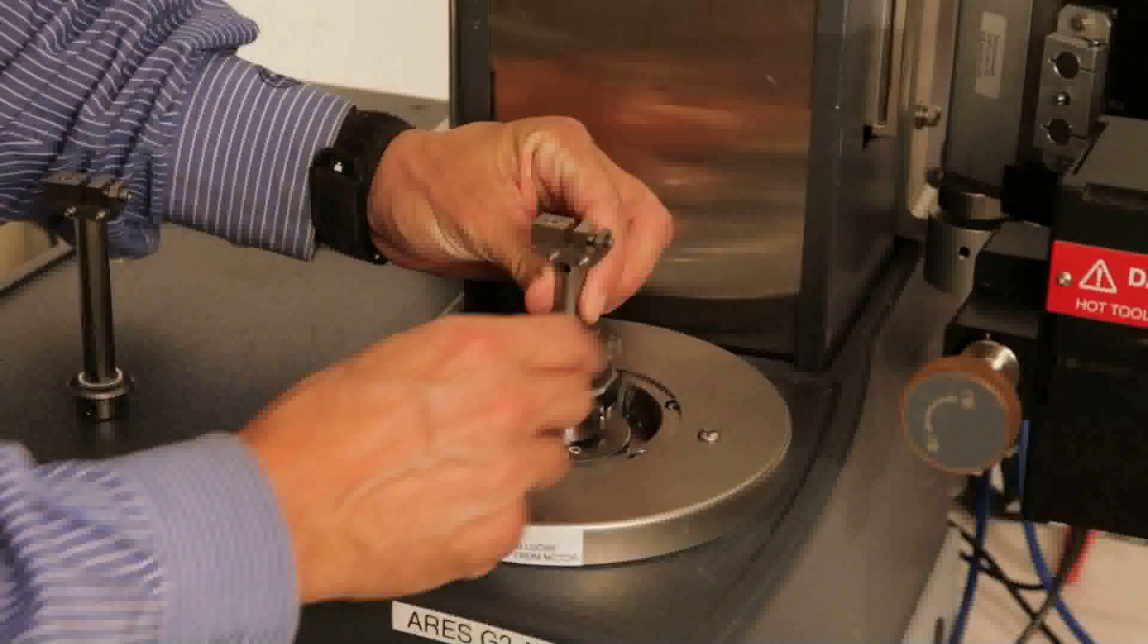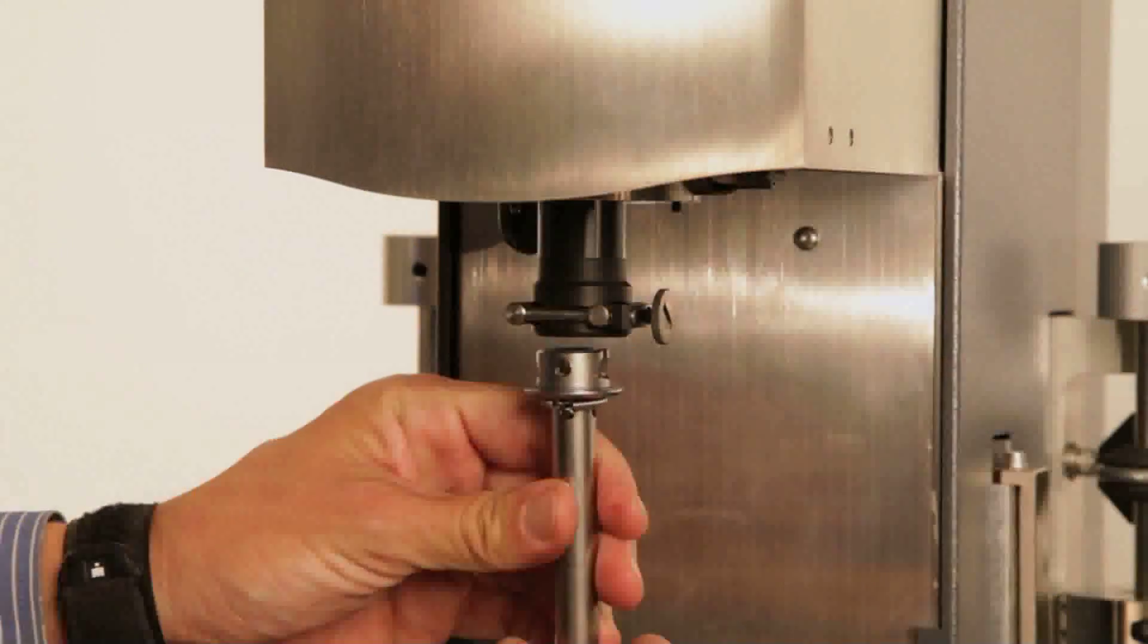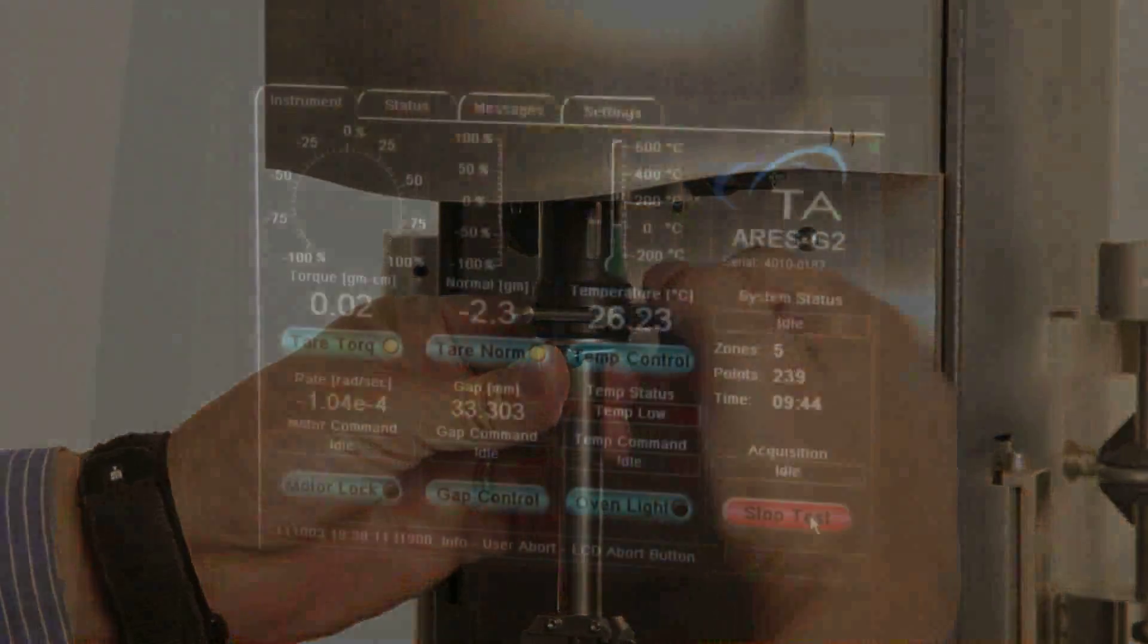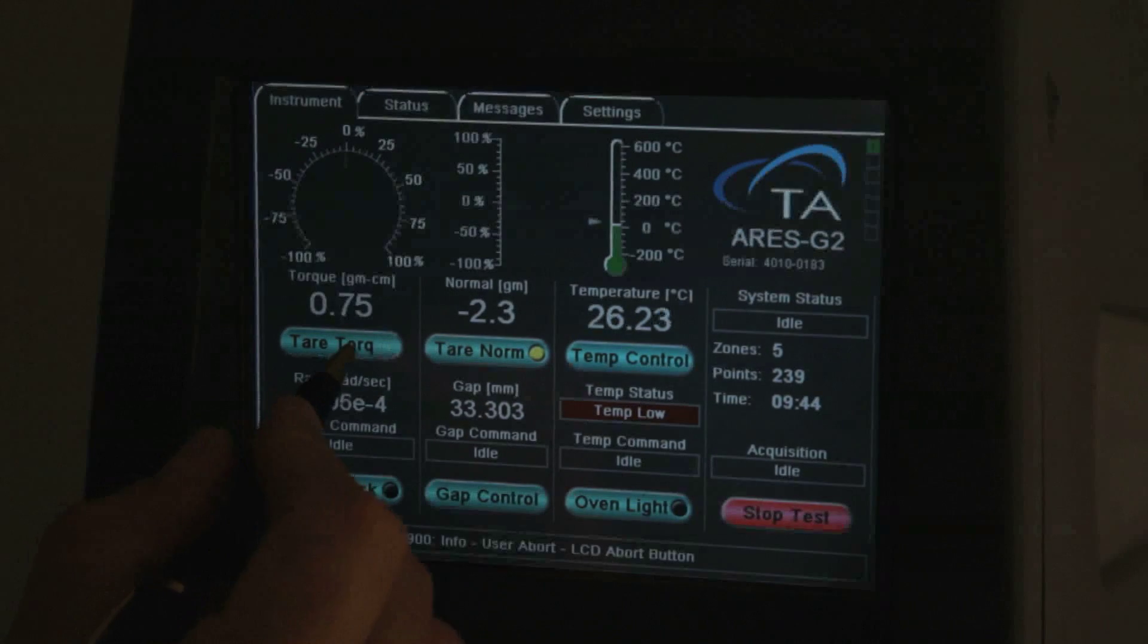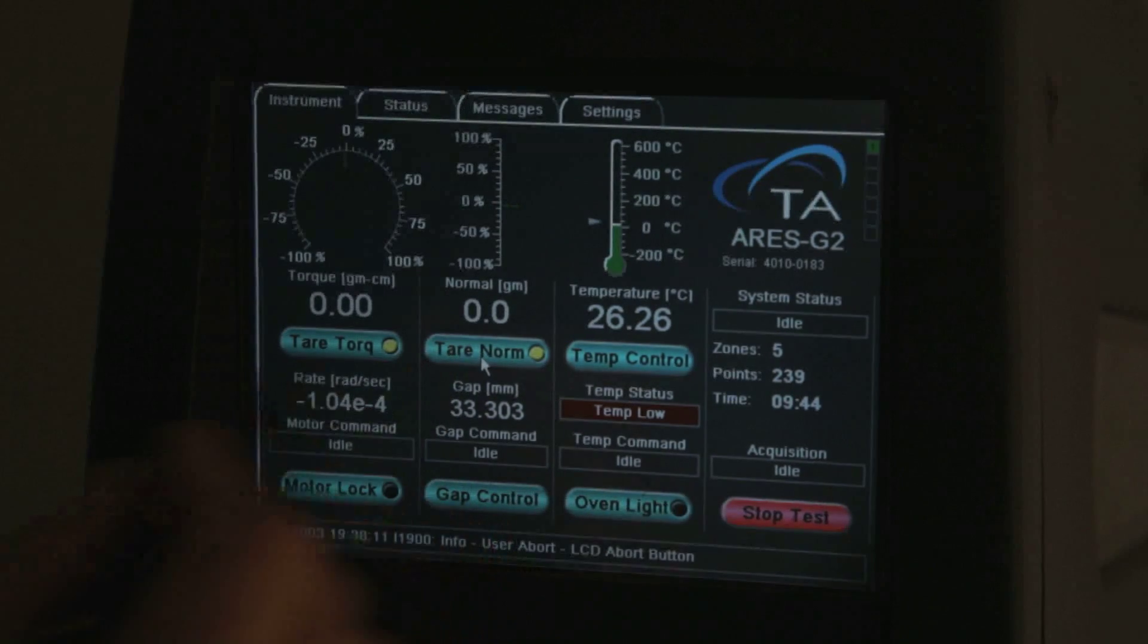Mount the lower fixture onto the motor mount. Mount the upper fixture onto the transducer shaft. Tare the torque signal and axial force signal using the LCD touch screen.